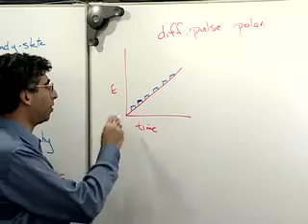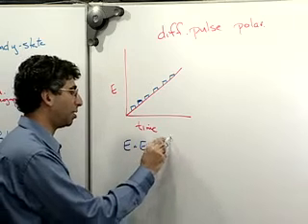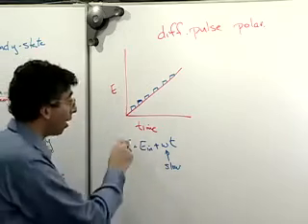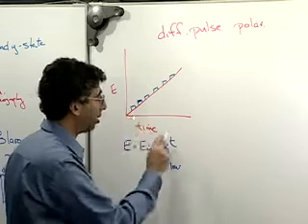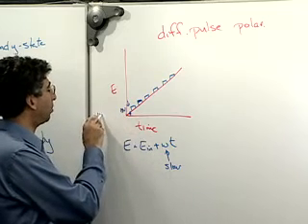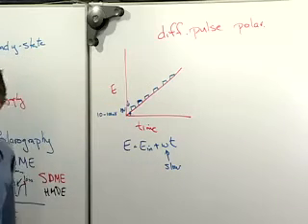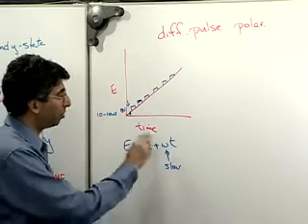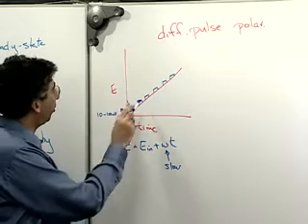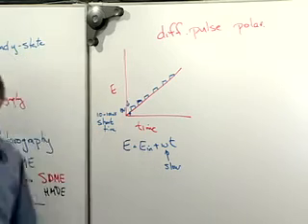So in other words, what you're doing is you have some waveform, E, that is equal to an initial potential plus a scan rate, which is very slow. And then on top of that, we're going to add a faster change, which is just a small delta V, somewhere between 10 and 100 millivolts at the most. We're superimposing that on top of this. And this is going to be for a fairly short time, say a second would be the maximum.